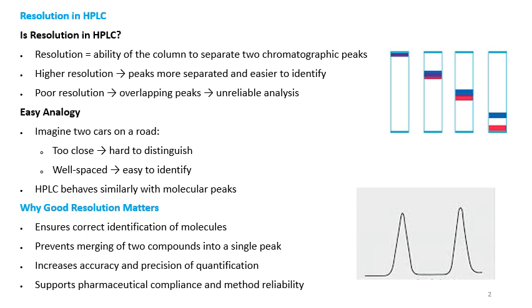So HPLC behaves in a similar way with the molecular peaks. You can check with the available image here. There are two peaks and there is a separation in the column shown by different colors.